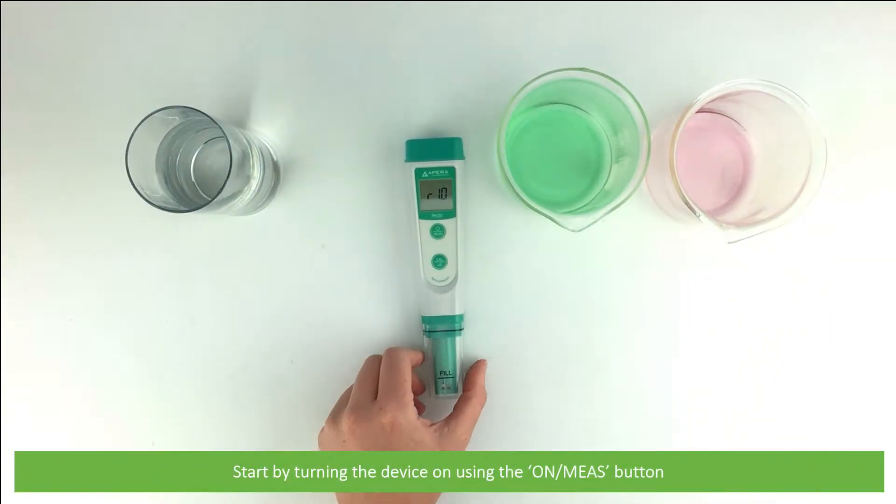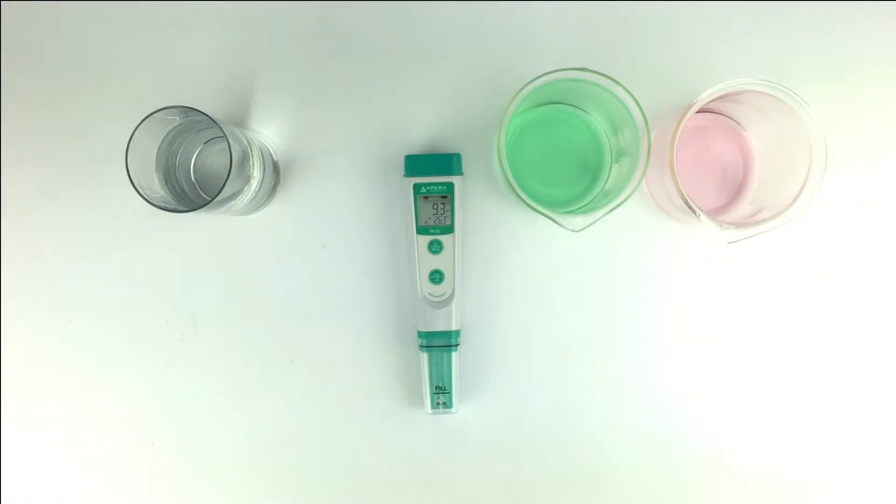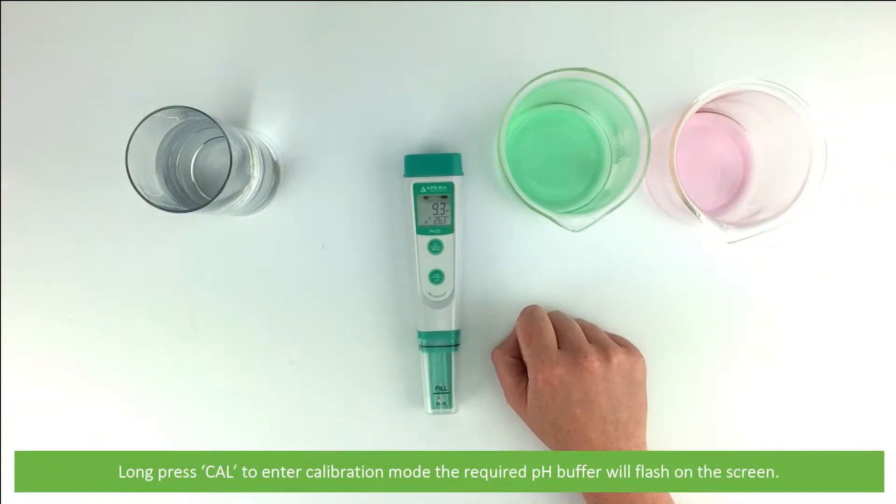Start by turning the device on using the on/measure button. Then long press Cal to enter calibration mode.